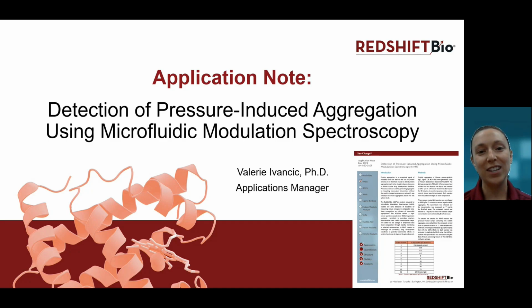Today I'll be going through our application note on how we can detect pressure-induced protein aggregates and distinguish those aggregates from natively folded beta sheet structure using MMS. If you want to read the full app note, you can find it on our website.